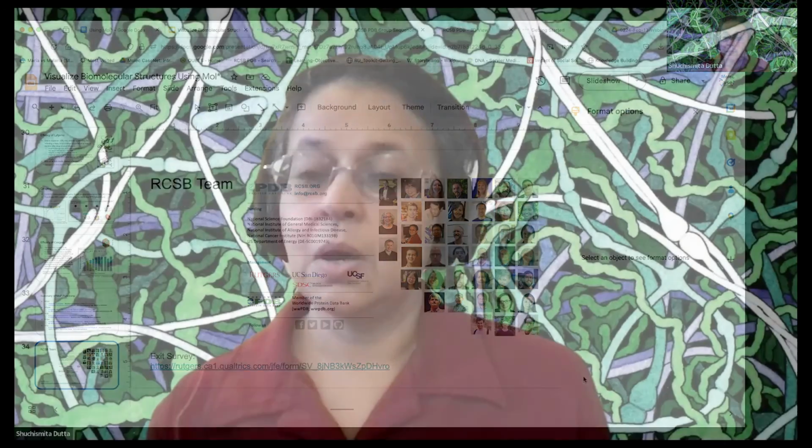In the PDB. Oh, so your question was about the alignment of disordered regions. Is that what your question was? Oh, how do you zoom in on the sequence alignment? Oh, that's actually quite easy. So if you are back, let me share screen one more time.